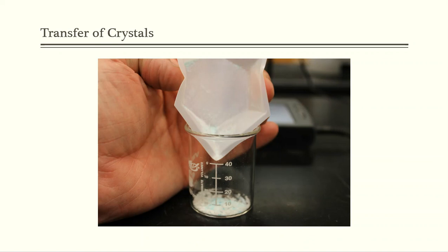So in this picture, what you're seeing here is me transferring this sample, sorry, it's not a solution, it's a solid sample, into the beaker that's down here below. So this is a separate beaker. I've just transferred it in here because I'm getting ready to add some hot water. If I added hot water to the plastic weigh dish here, it would begin to melt it and it would get really flimsy on me. So I had to transfer this material into a suitable container for that.